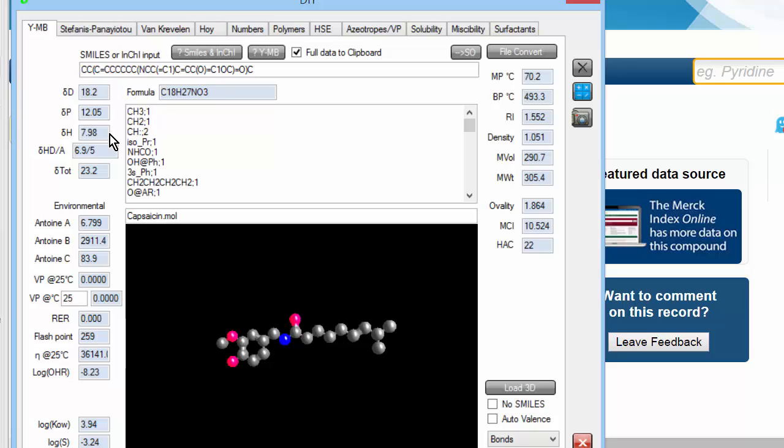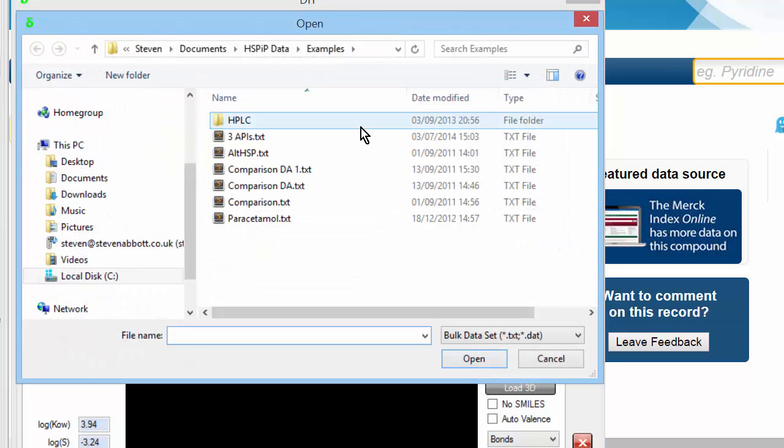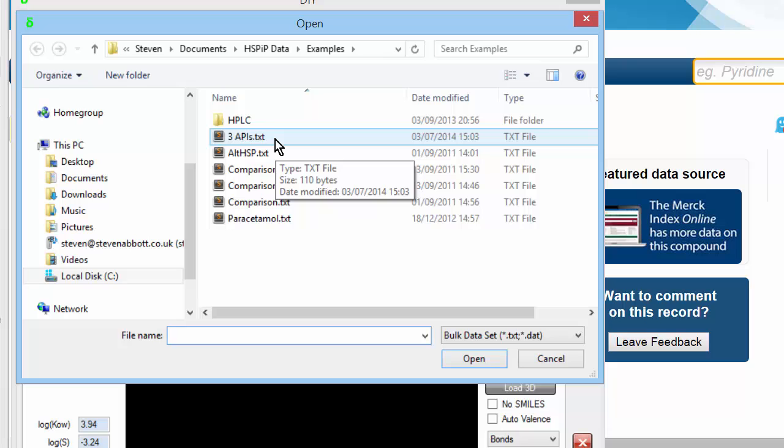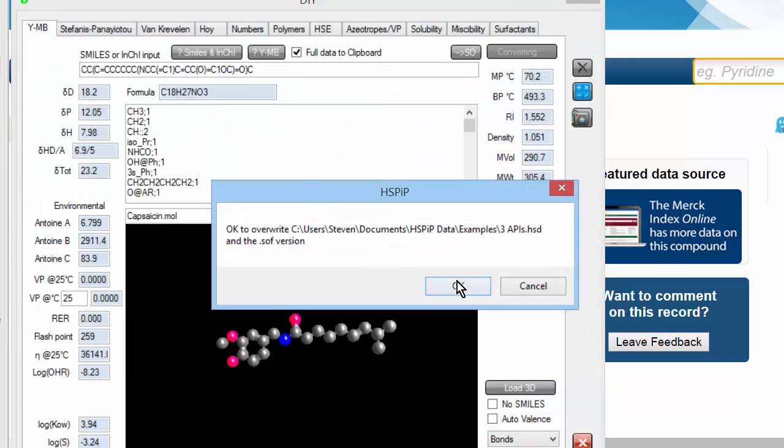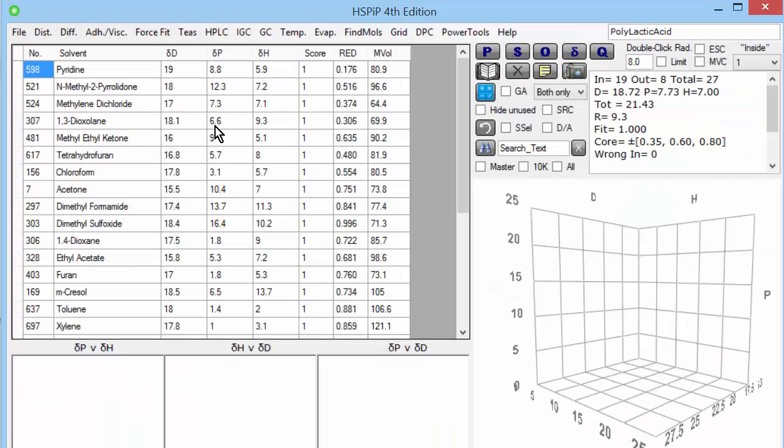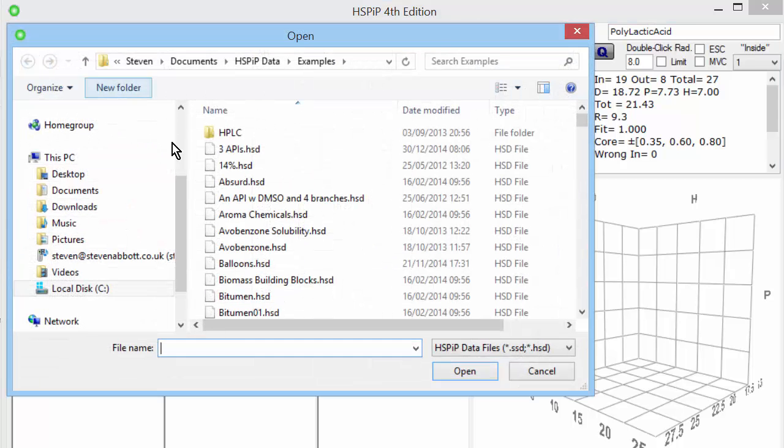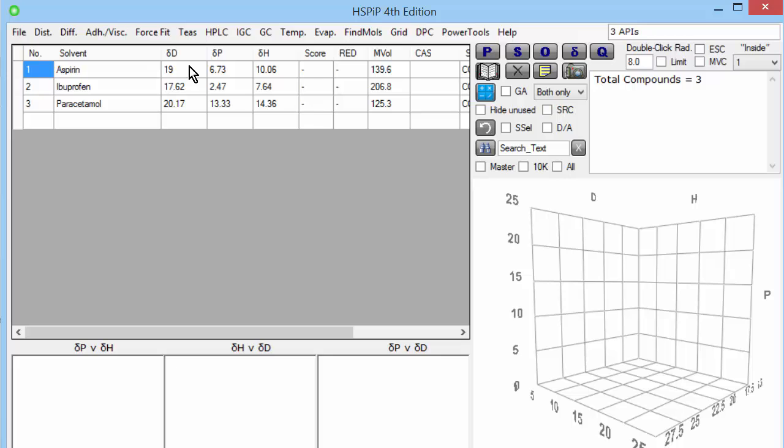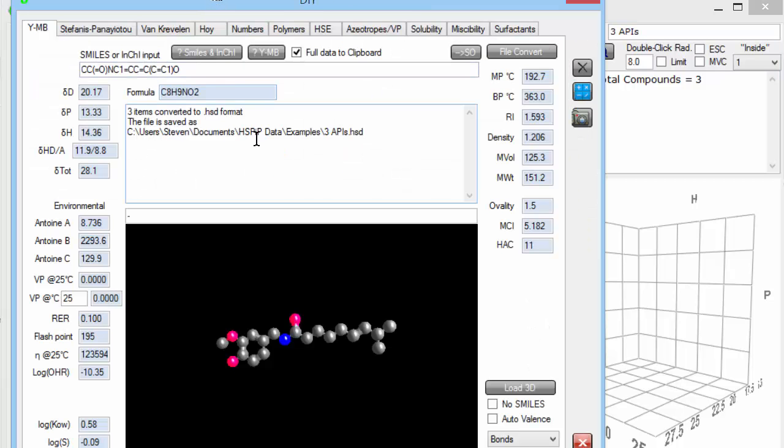Often, you want to calculate the HSP of a large list of chemicals. And you can do that via file convert. You have a little text file. I've got a small one here, 3APIS.txt, which is just name and smiles. Double click on it. I've done this before, but I say it's OK to overwrite. And it's just converted the three items I had in that list. And it's stored them as a .hsd file, which is the standard HSP IP file. So I just go to there, and I open it. File, open, 3APIS. And there's the estimated HSPs of aspirin, ibuprofen, and paracetamol.